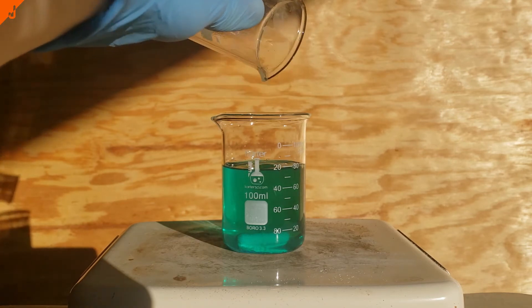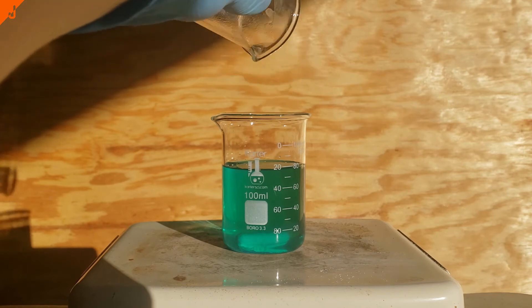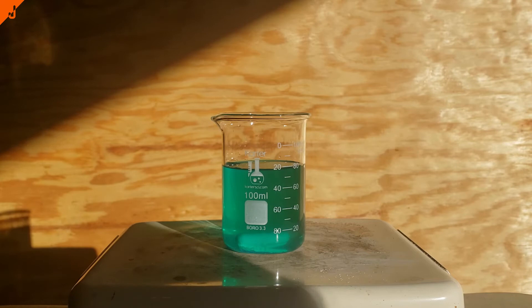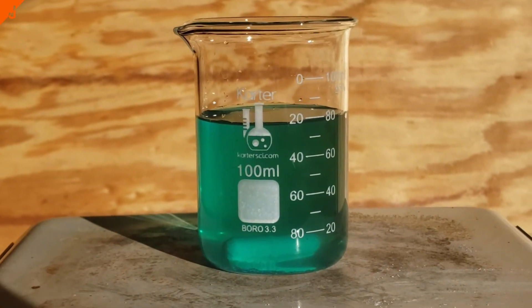Once everything was added, you can clearly see the vivid, bluish-green color of the copper-2-bromide in solution. The interesting thing about copper bromide is that the color it is when it's a solid is completely different from that when it's in solution.